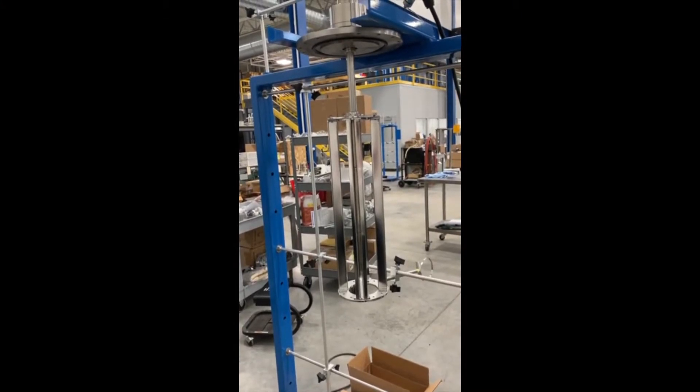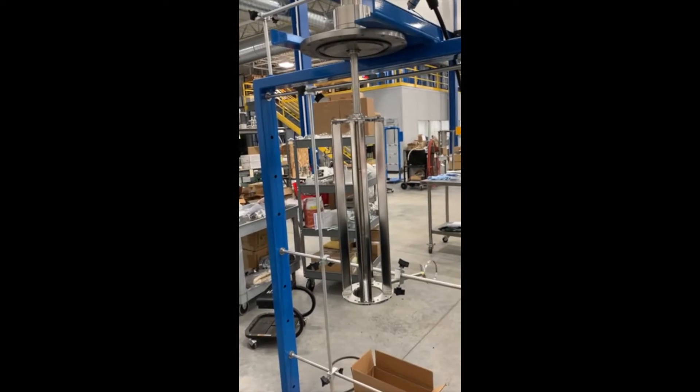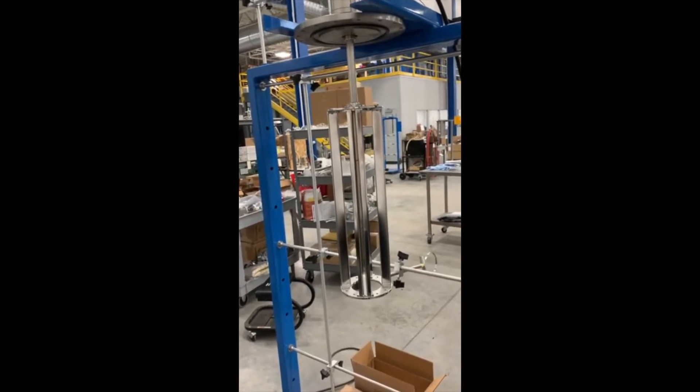Hi, I'm Ben Colchin of Pope Scientific. In this video we're going to talk about wiper wear and also potentially balancing your wiper retainer on your wipe film still.